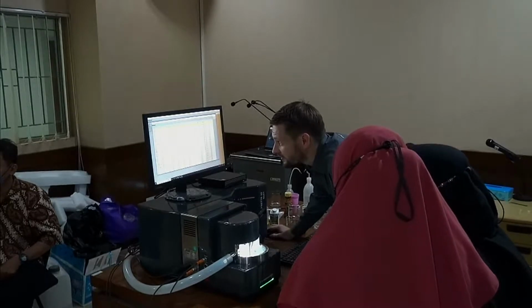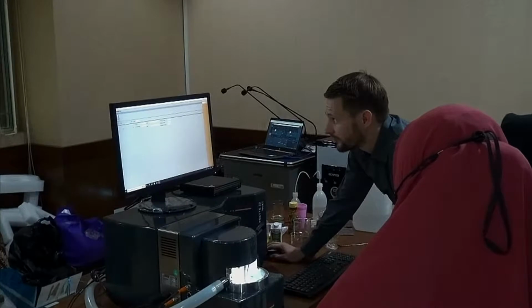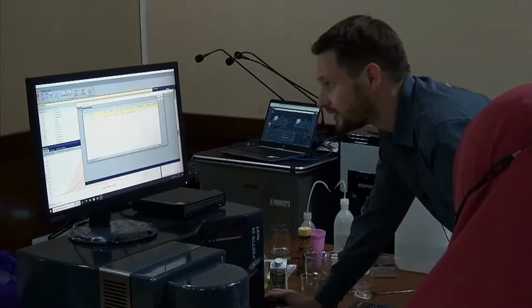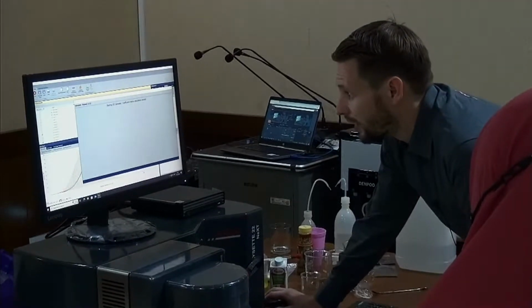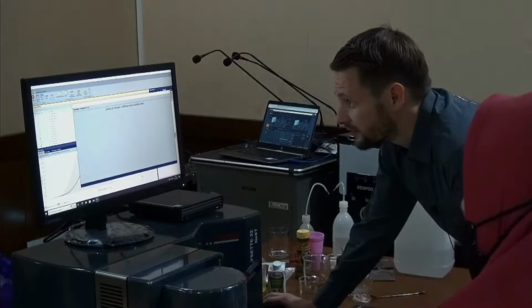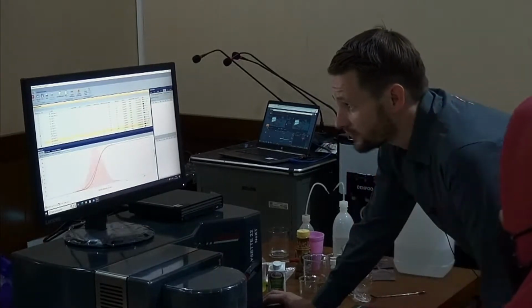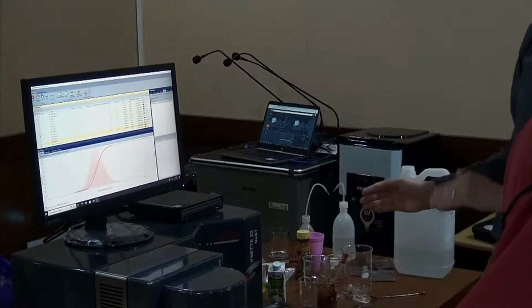Magnetite. There we have magnetite. So let's just try these values. Say OK, and the number was, I think, 156. And what you see is that's the original one. So that's the same measurement, exactly the same measurement, just the calculation is different.